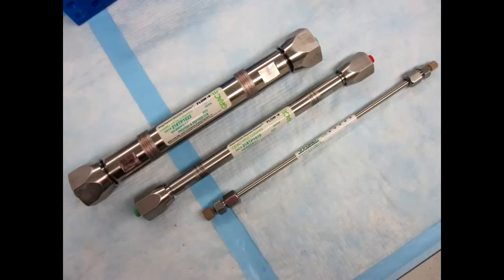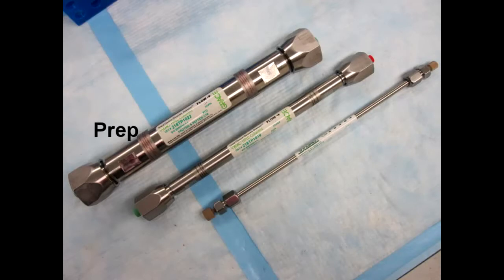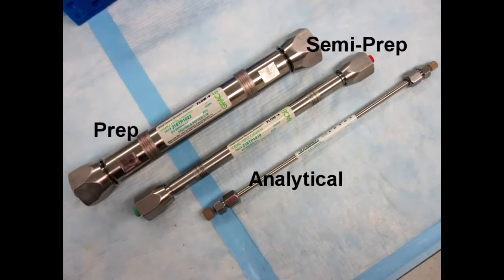The three sizes shown here are prep, semi-prep, and analytical. For the prep column, the largest column, we add 5 to 10 milligrams of peptide each run. For the semi-prep, it goes down to about 1 milligram. And lastly, for the analytical, 0.1 milligrams of peptide is the recommended amount. These amounts are based off of a 2 to 3 kilodalton peptide sample. Make sure your sample is fully dissolved for it to be effectively separated by the column.